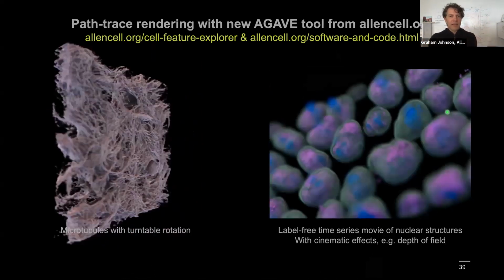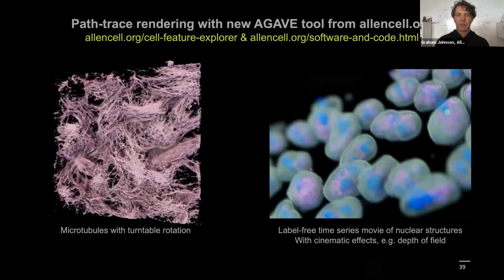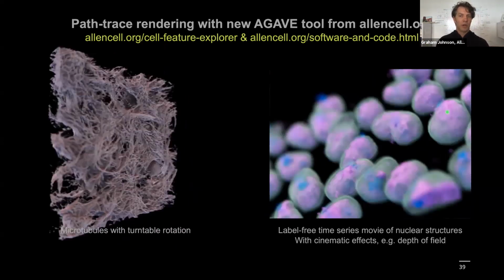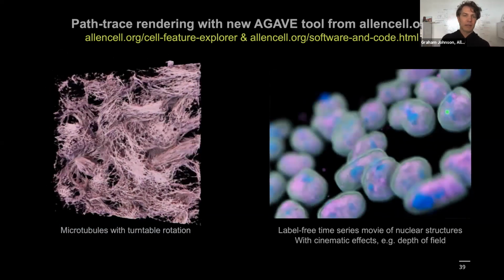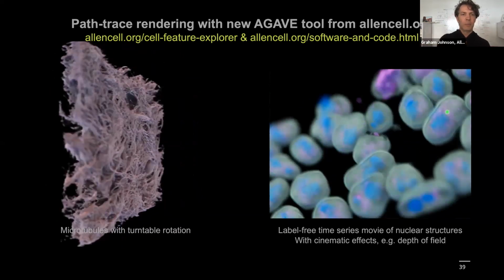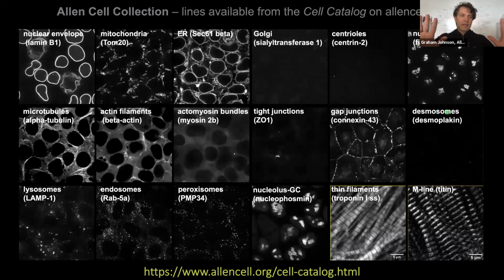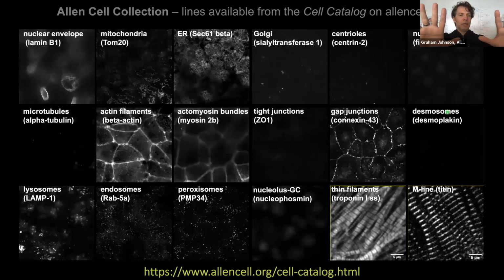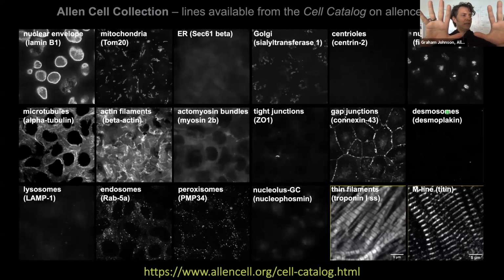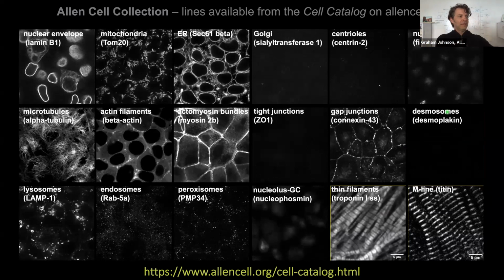We collect this data in 3 dimensions, and we have a growing number of different types of microscopes, but our initial workhorse that's been able to allow us to do this robotically and automatically has been the spinning disc confocal microscope. And these are just some examples. These are Z-stack movies, so they might look like a time series, but we're just starting at the bottom of the cells in their plates and scanning through space up to the tops of the cells.